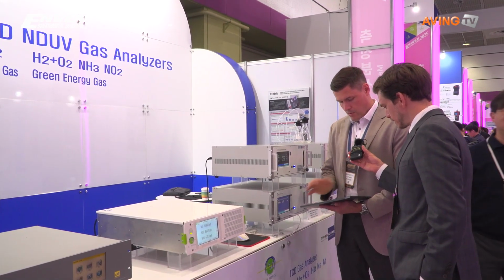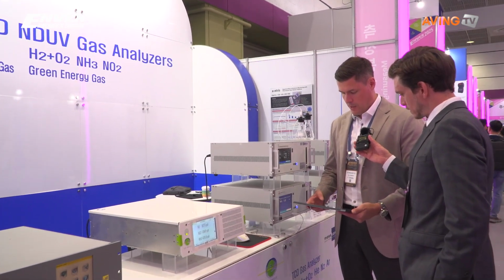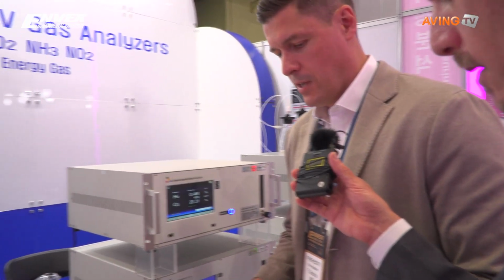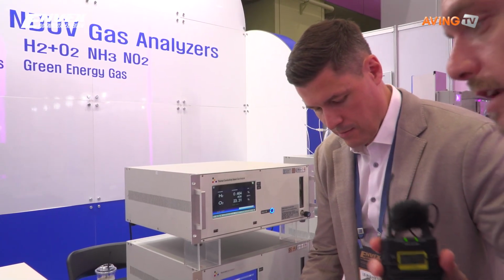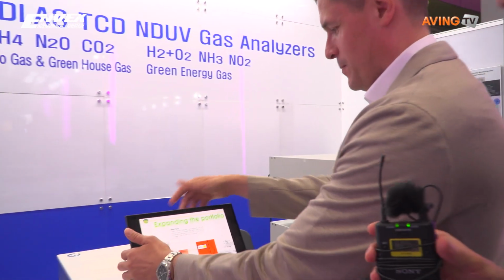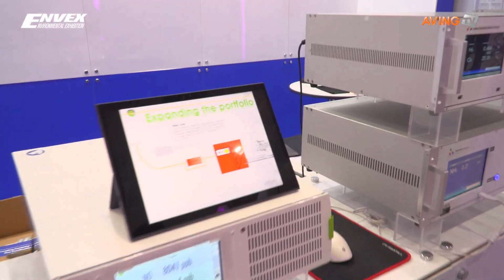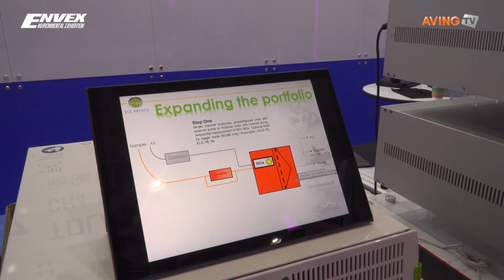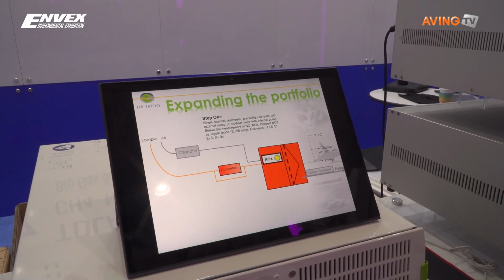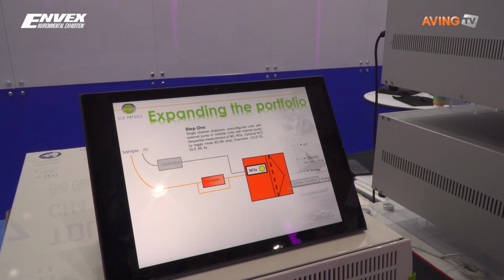So when you start building a chemiluminescence analyzer, these are usually the components that you need. Our camera can capture and you can talk us through it. Basically, every chemiluminescence analyzer consists of this. You have 2 lines of gas flow. The sample line is the sample you want to measure. Then you have the air line, which is basically just sucking in ambient air.